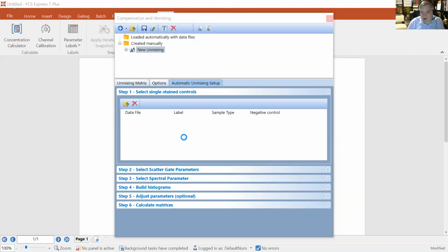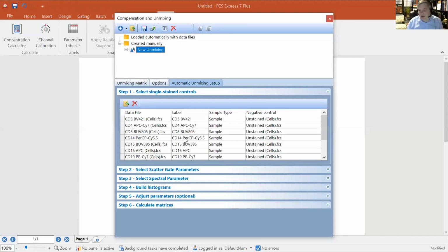When we're working with data from the Aurora instruments, we get a lot of information associated with them, so again it takes a little bit of time to load these in. I don't think that was any crazy amount of time to wait, because we don't have to wait after that. This is the only hit that we take, waiting for our data files to load.